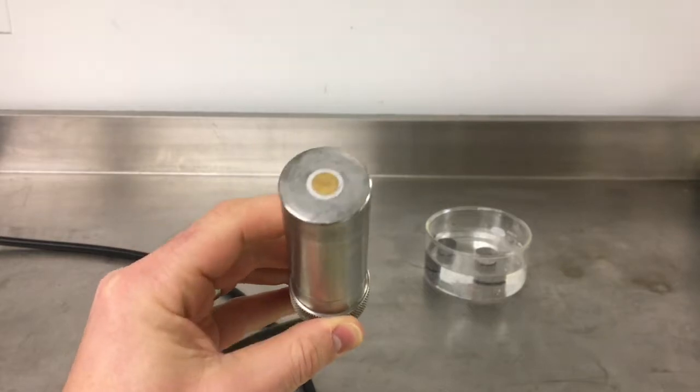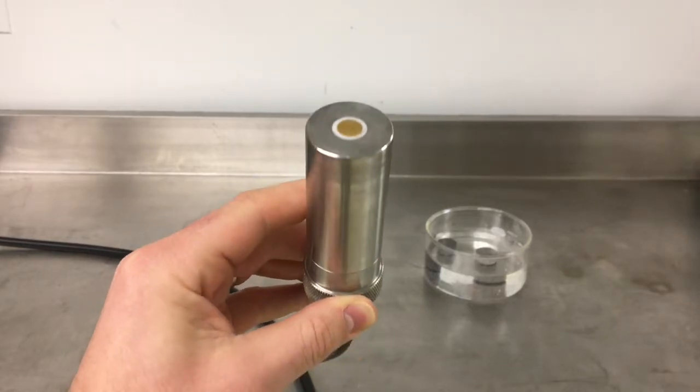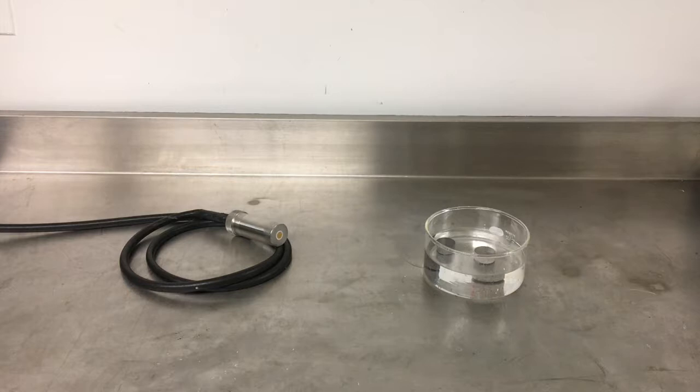All you need in order to determine the zeta potential of a porous core is its porosity. Our porosity video gives a simple demonstration of how to determine the porosity using our high-frequency conductivity probe.